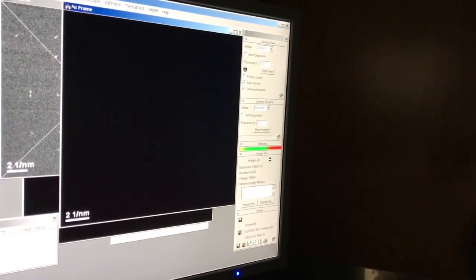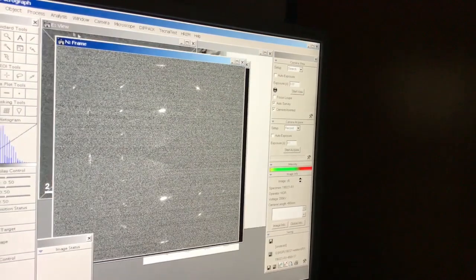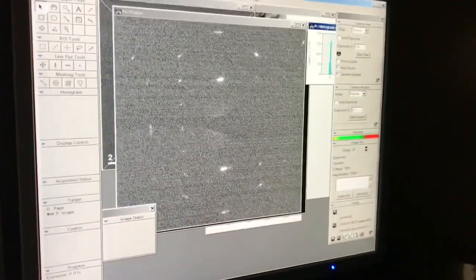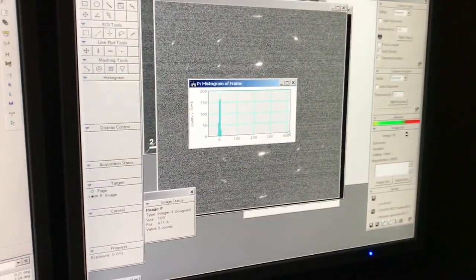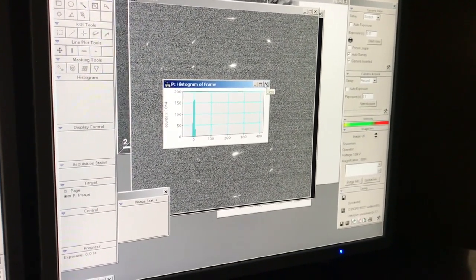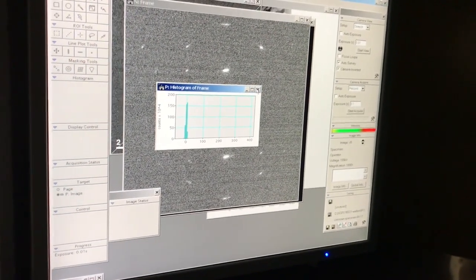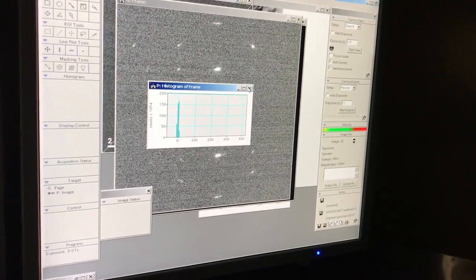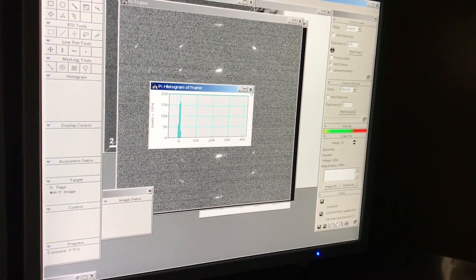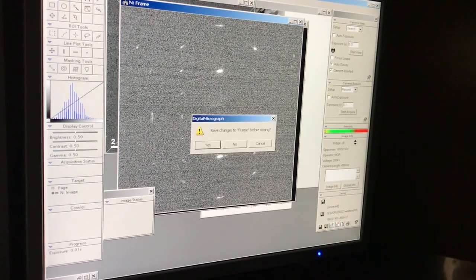0.1 is a good test exposure time. Okay, and then if I can do the same thing, analysis histogram, so I'm only getting to 400 here. Realistically now, whereas before I was stopping at like half a second, I could probably put in 2 or 3 seconds and not have a problem. And actually I'm going to get probably a very nice looking pattern by doing that.